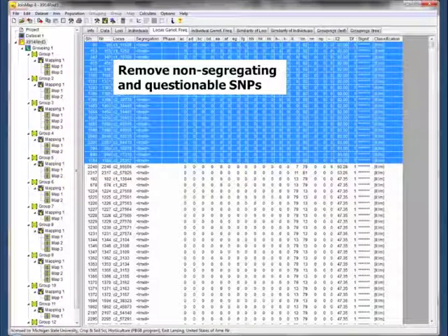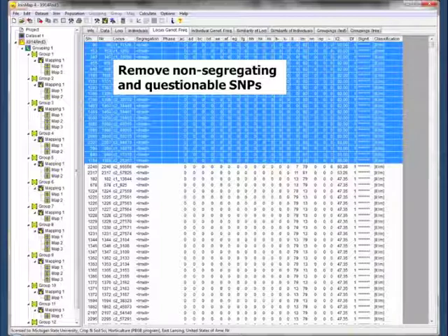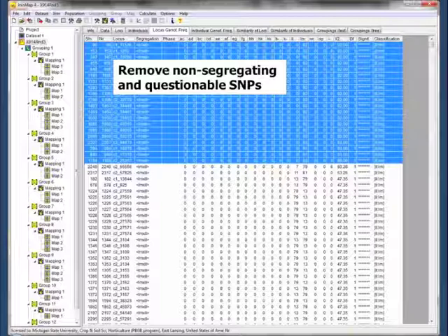Now you've run that in JoinMap. One of the first things we get is some segregation data. Here are our SNPs and the progeny going across, and over here you can see the chi-square value and the segregation data. On the ones highlighted in blue, all these were ones that had a heterozygous parent and homozygous parent — we expected a one-to-one segregation and we had 92 to zero. So we removed those. We can see the skewed ones here: 79 to seven, 81 to 11.